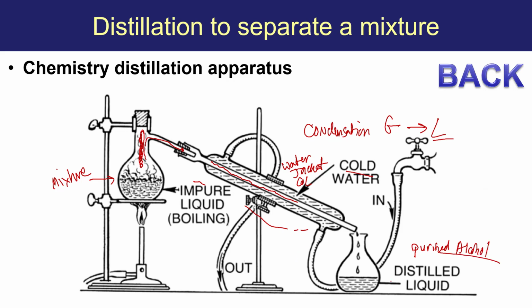You can do this process multiple times on your distillate that you got as a result of your process. It is sometimes called twice distilled or 3 times distilled alcohol. Let's put it this way, it's incredibly concentrated. Be careful. So that is how distillation works with a distillation apparatus in the chemistry lab.